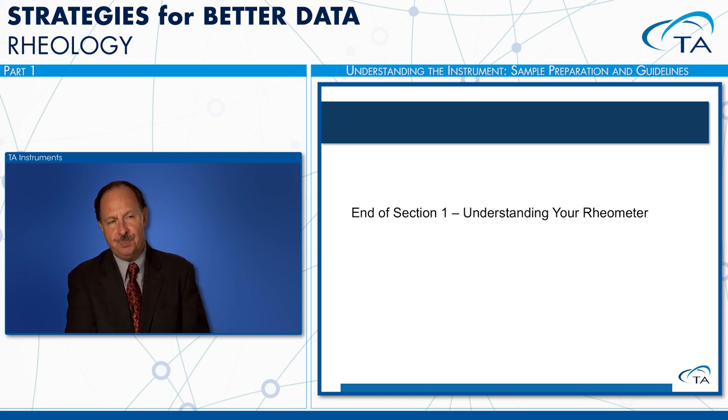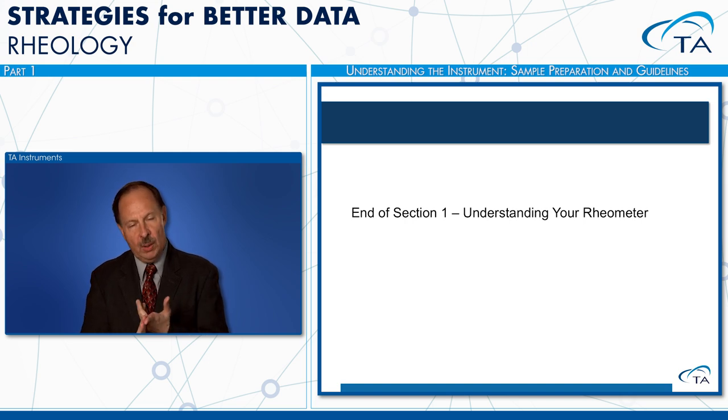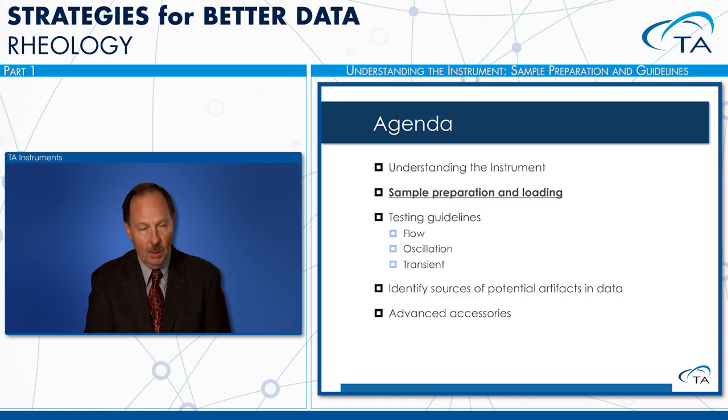Remember that the main things that we're looking at are the torque, the angular displacement resolution, and the angular velocity. And when we use the different geometries and we use the appropriate factors, we convert the machine parameters into the rheological parameters, which will give us fundamental properties of our materials.